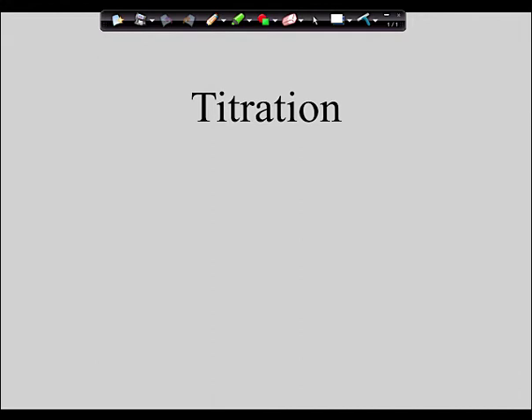Then, guys, this is the way the rest of the day is going to go. We are actually going to do the lab today. Now, guys, this is all of the stuff that you need in order to do this lab. And I'm going to show you how this works. But you are never going to get to lay hands on any of this stuff in this class this year. Guys, what we are going to do, and this is what I'm going to do with you, given these instructions, is we are going to do this lab through virtualization.